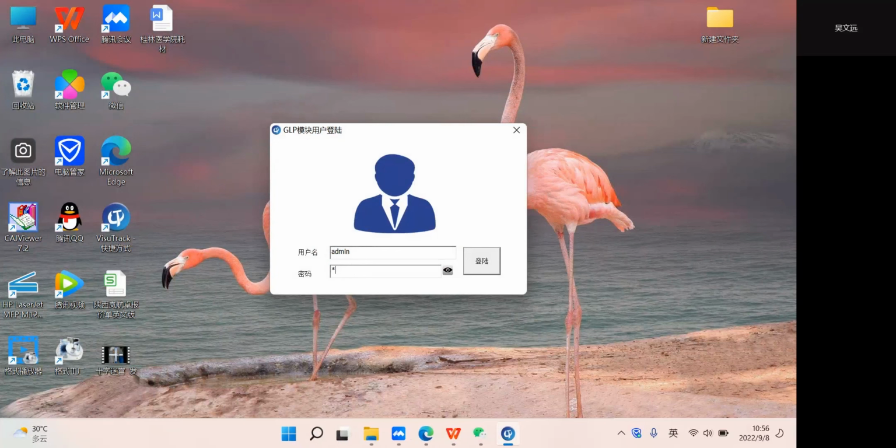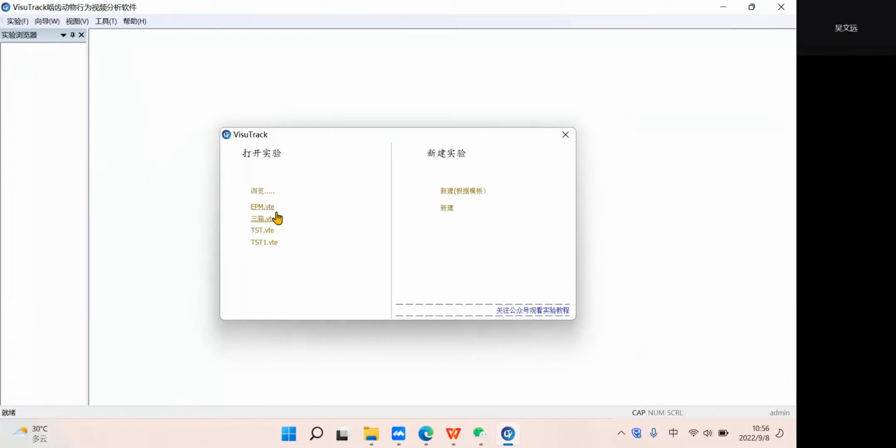My presentation software is fully modular. Here are some of the experiments we have done recently. They will be displayed on the left. Up to 5 will be displayed. For some reason, some experimental files may be deleted by you and cannot be opened here.